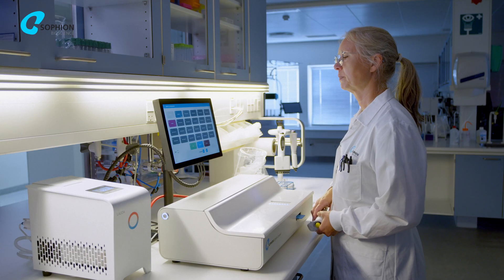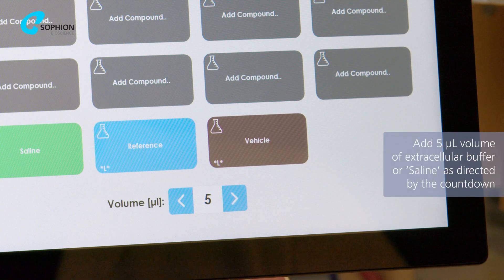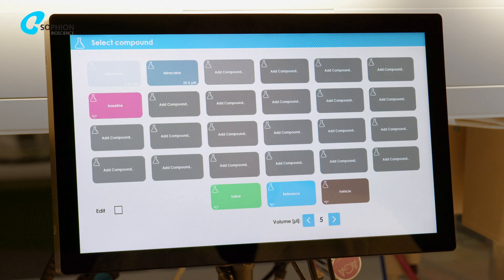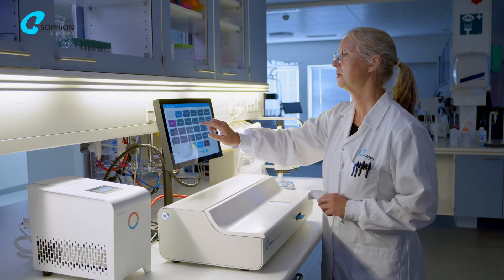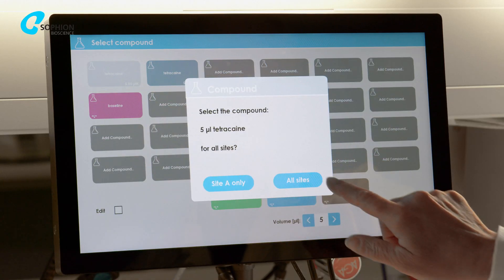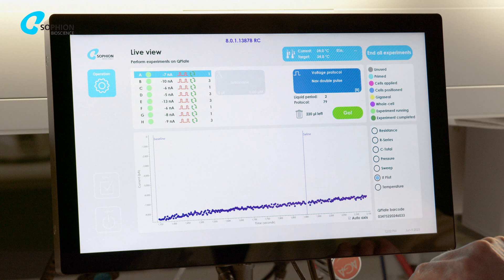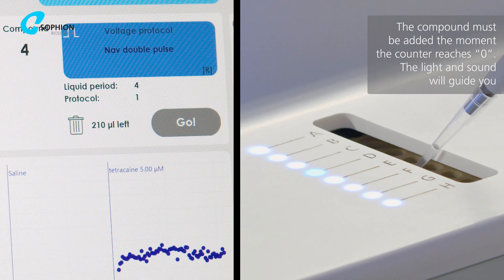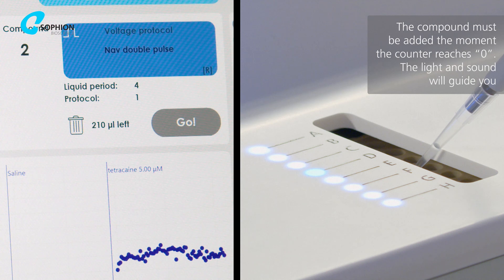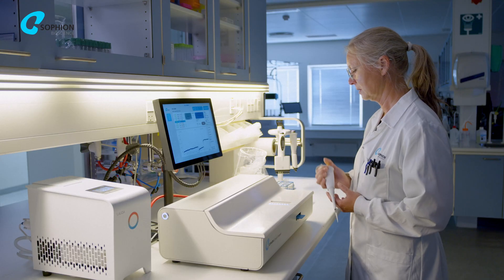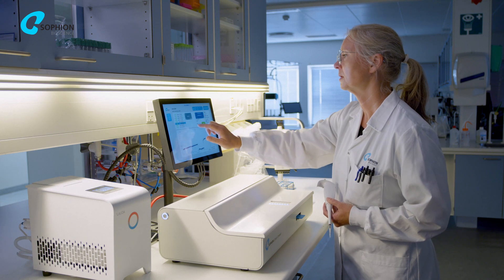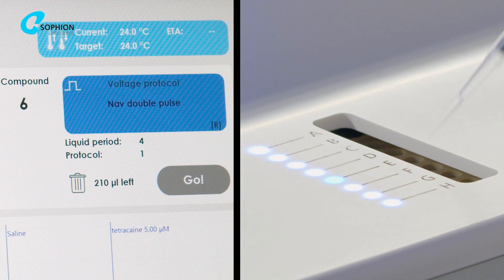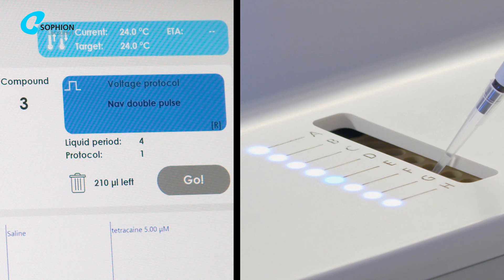To evaluate compounds, make a vehicle-only addition before adding any compound to establish a baseline. Select the compound you want to add. You can apply the compound to a specific site or use the Apply to all option to apply the same compound to all active sites. Press the Go button for each of the active sites and the countdown will indicate when to add a compound to the next site. The timing here is essential for the integrity of the assay and for accurate data analysis. Always remember to add liquids by reverse pipetting.